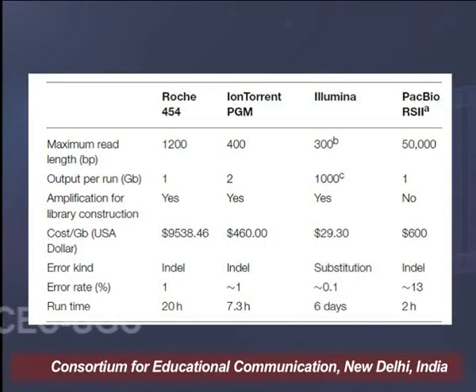Because it gives you a very accurate result, the speed is very good, and the costs have come very low. I have several examples here, but the study we are talking about today uses Illumina sequencing because of the obvious choice of good speed, low cost and reasonably good accuracy, because in environmental samples accuracy is very important.